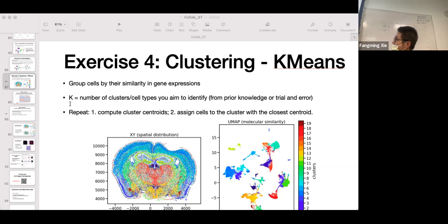The first line does PCA by applying normalized features. You just get PCs. The second line does UMAP. You just get UMAP. And the third line does clustering. Okay, then you can represent it. You can plot it out with another line, which you figured out how to make a plot previously. Yeah, it'll take some time for you to get efficient on this, but that's the overall idea.